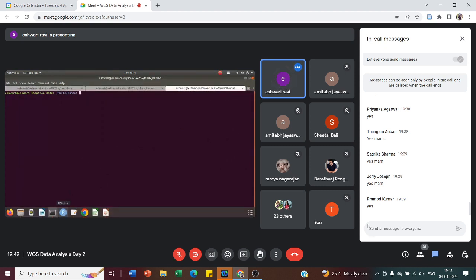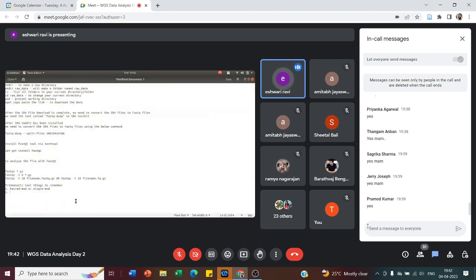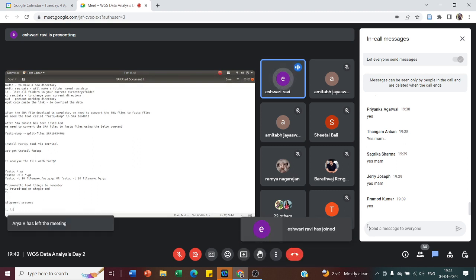Before the alignment, we index the reference genome which we have downloaded. Every alignment tool needs to have an indexed sequence of the reference genome for performing alignment.